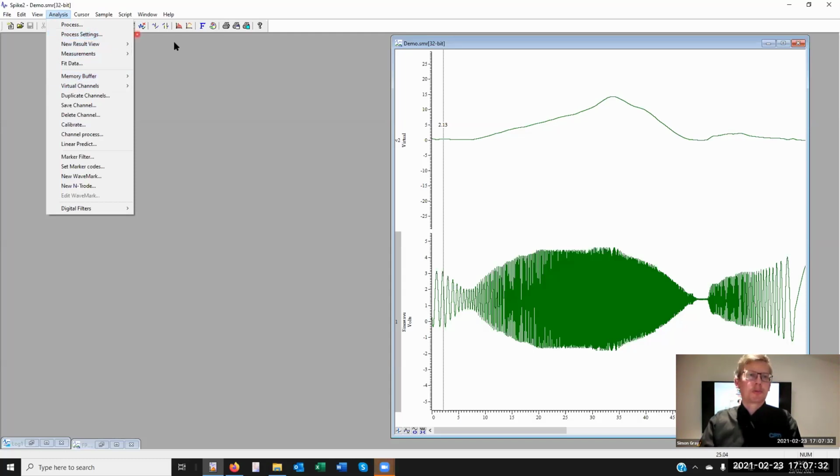Well, I'm glad it's helped everyone. An hour is a very short time to get all this information across. Again, hopefully we've shown you what is there, what's available, and hopefully you'll go and investigate further yourself. Slight changes between version 10 and 9, etc., but fundamentally the dialogues remain pretty much the same. With older versions, as I mentioned, being able to process a single channel, maybe not multiple channels.